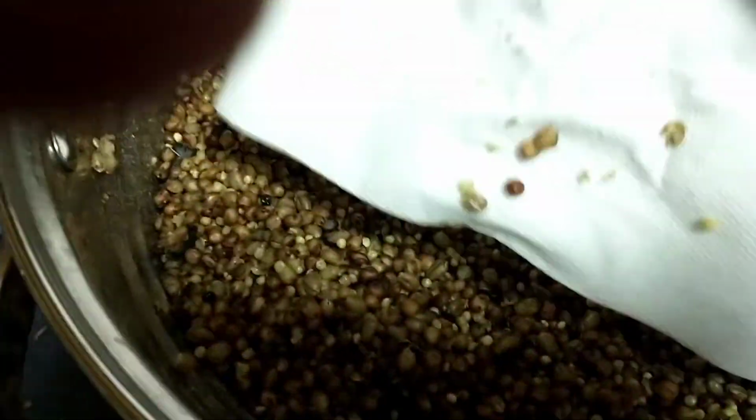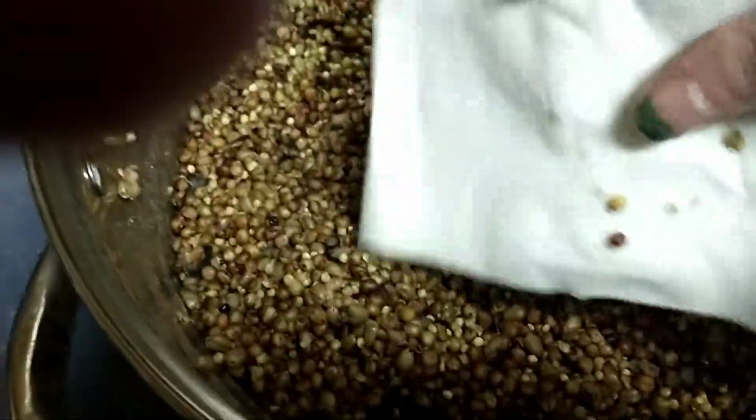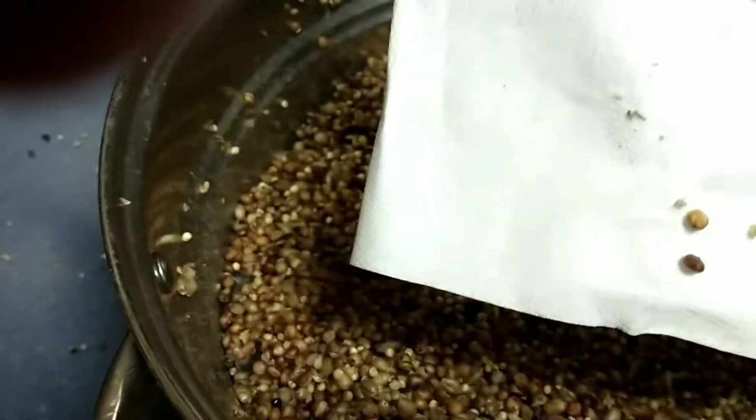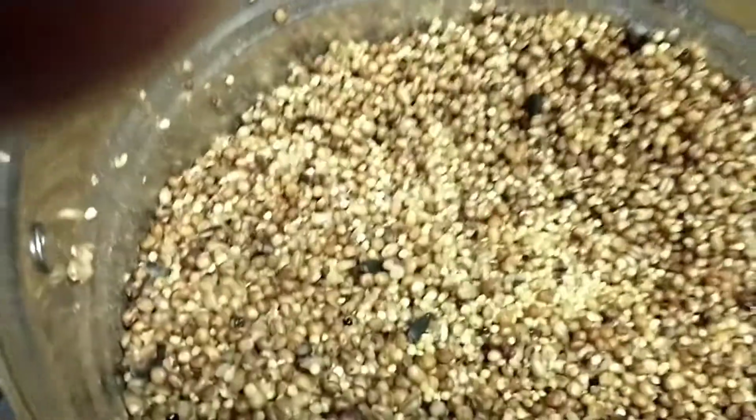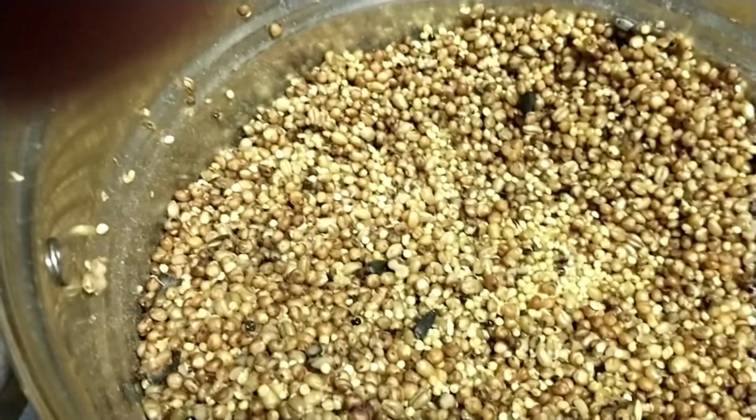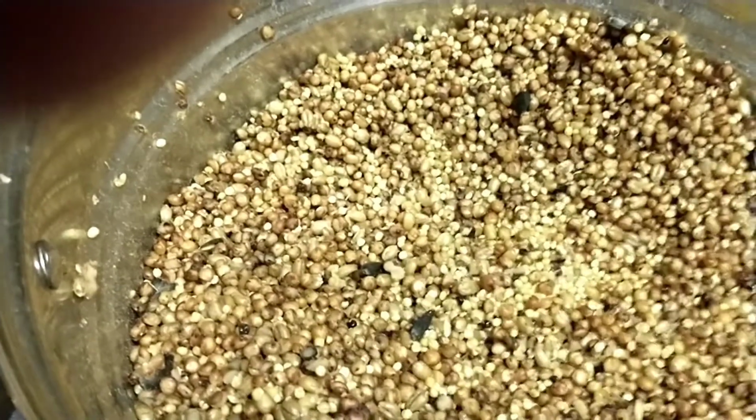Pick that up. And aside from them sticking a little, there's no water on the toilet paper. So they're ready to go into jars. Alright, I'm going to jar these up and come back once those are done for the next step.